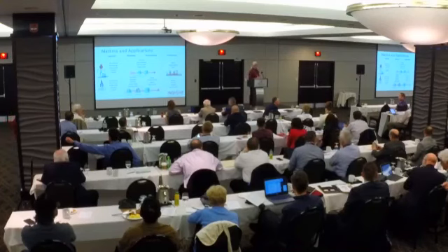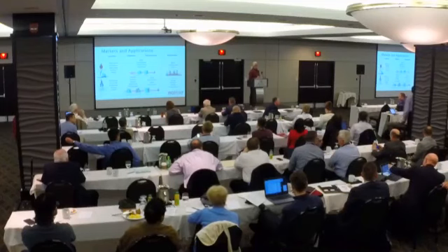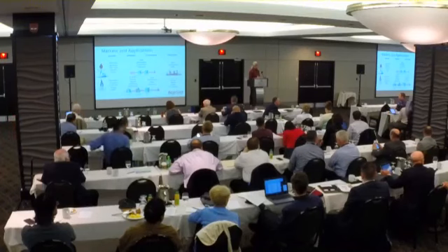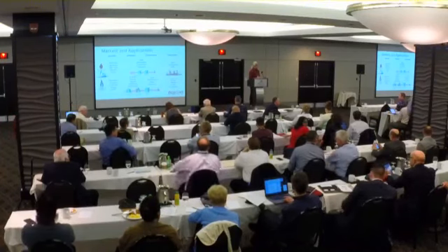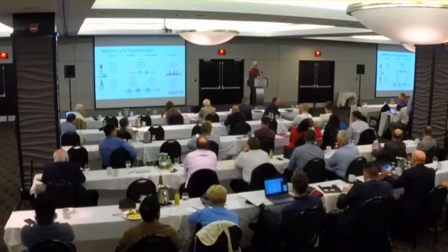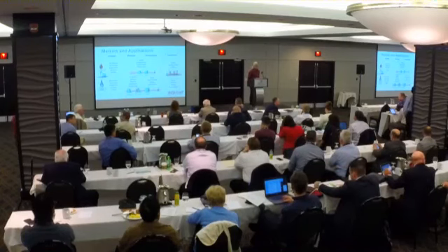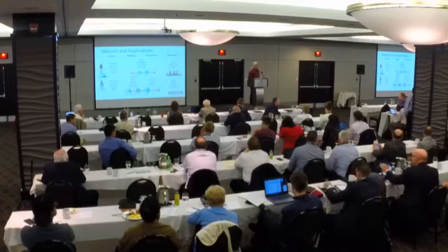I'm Ahmed from Intertech. Personally, I am a big fan of using this IR spectrophotometer in the analysis of the petroleum product, whether it is MIR or NIR. But I know there is some limitation with this technique. Obviously, we are required to analyze different products coming from different sources. So my question is, how much could matrix interference in terms of impurities affect the consistency, precision, or accuracy of the results?